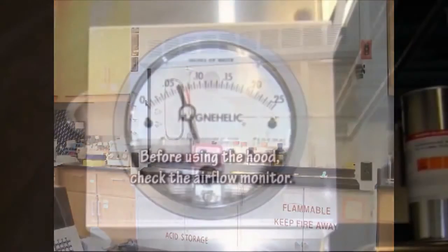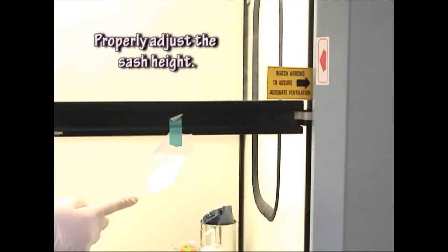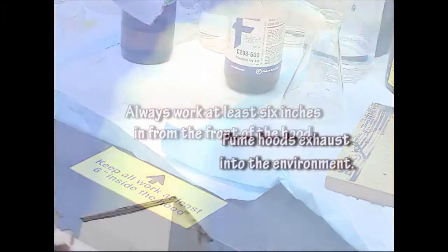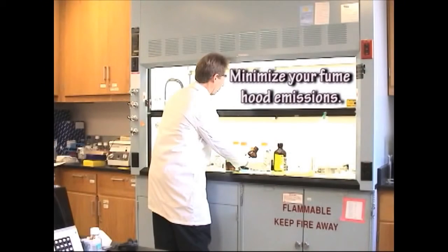In review: before using the hood, check the airflow monitor and properly adjust the sash height. Always work at least six inches in from the front of the hood. Fume hoods exhaust into the environment, so minimize your fume hood emissions.